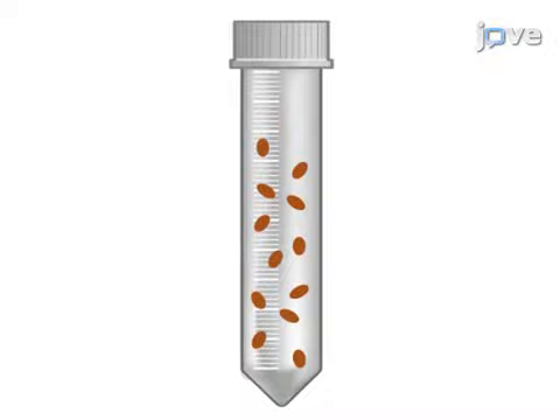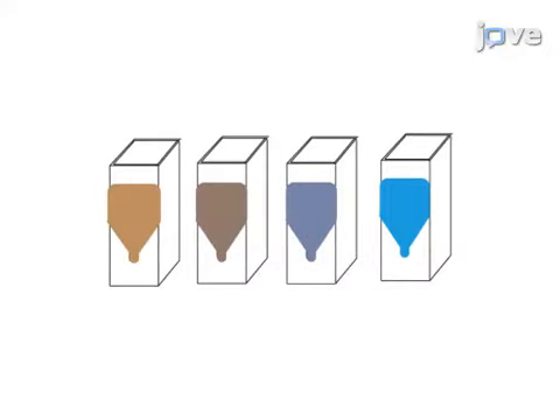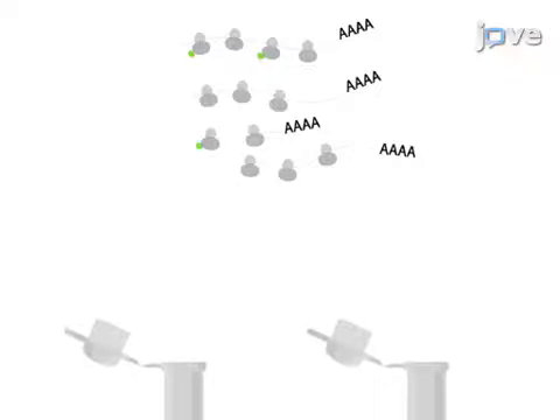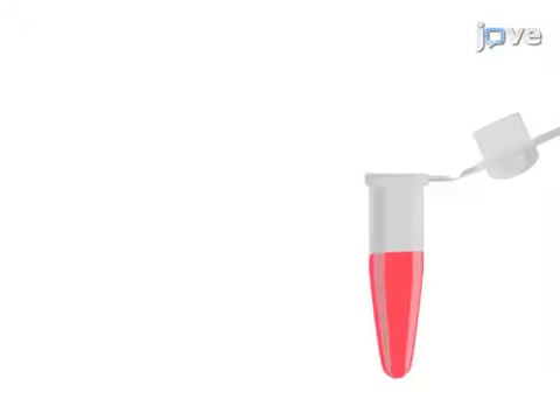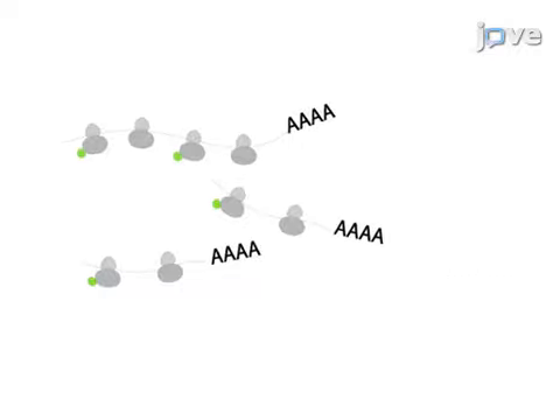The second step is to generate a lysate to obtain a polysome preparation containing a mixture of tagged and untagged ribosomes. Next, the protein concentration in the lysate is estimated and affinity purification is performed with beads coupled to GFP antibodies to capture ribosome RNA complexes from the cell type of interest. The final step is dedicated to trizol RNA extraction and purification.